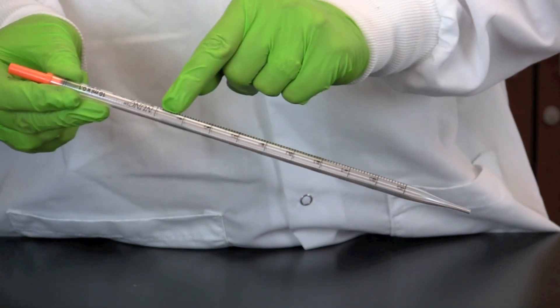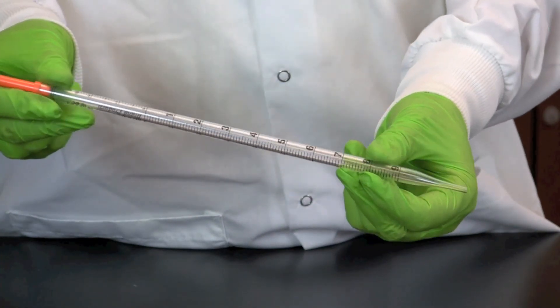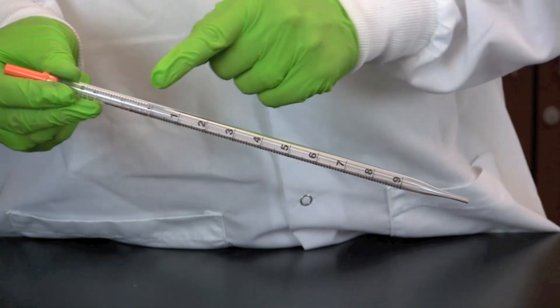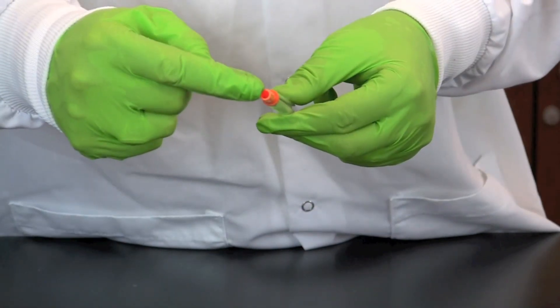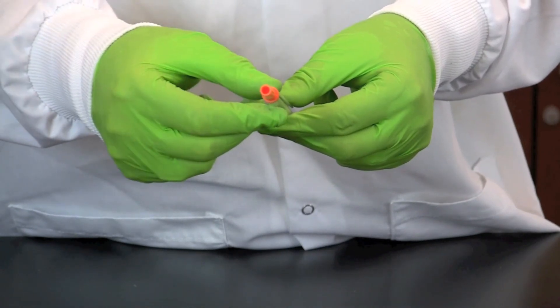Serological pipettes have two scales, one for filling and on the other side, one for dispensing. They often have a cotton plug in one end to prevent contaminants from being drawn into the vacuum source.